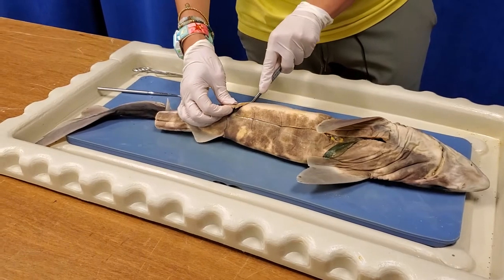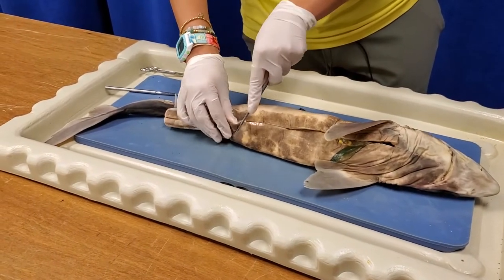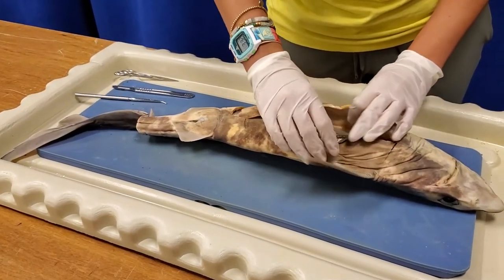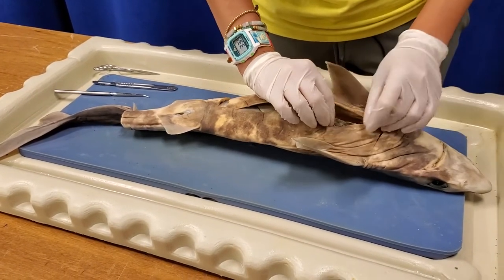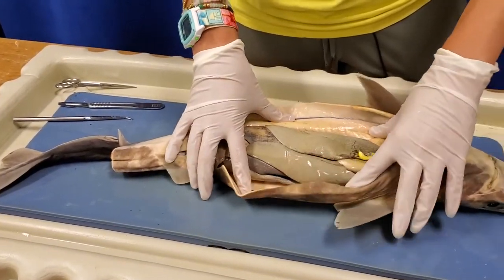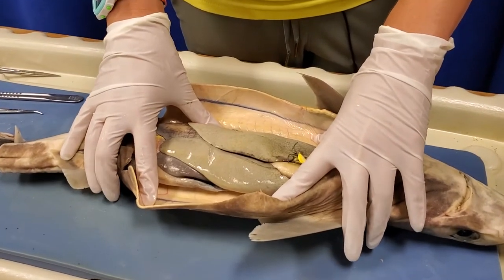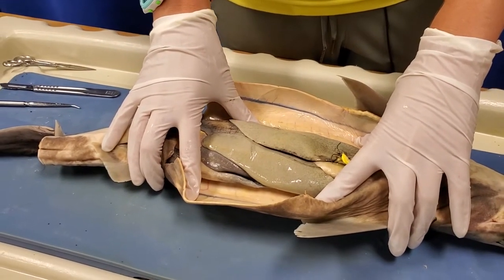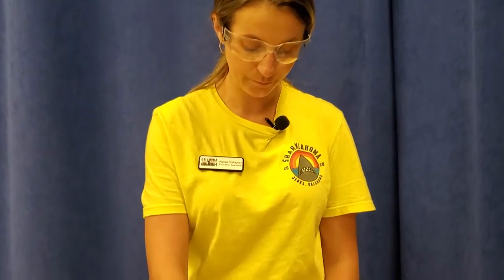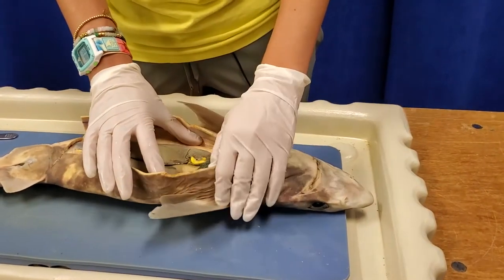I'm going to cut in on each side so you can see a little bit better. One of the first things you might notice is that it doesn't have any bones. Sharks belong to a group called cartilaginous fish, meaning their entire skeleton is made up of cartilage — the same thing we have in our noses and ears. It's tough but more flexible than bone. The hardest parts of a shark's skeleton are its jaws, teeth, and the areas around its heart and brain. The teeth and jaws are the only parts not made of cartilage.